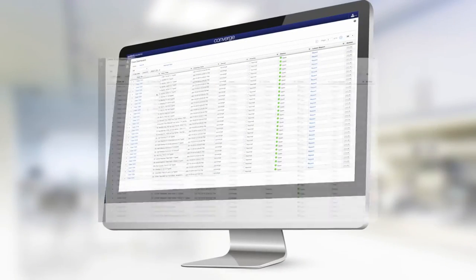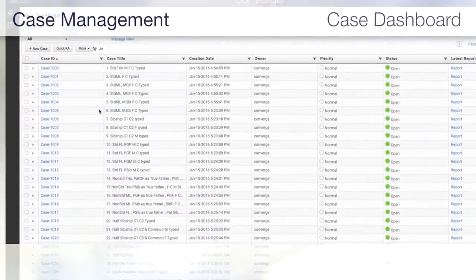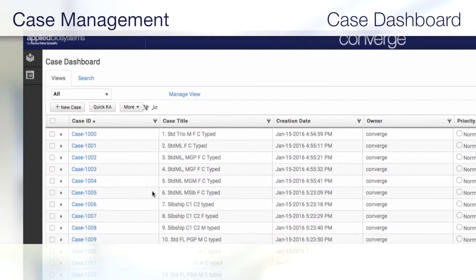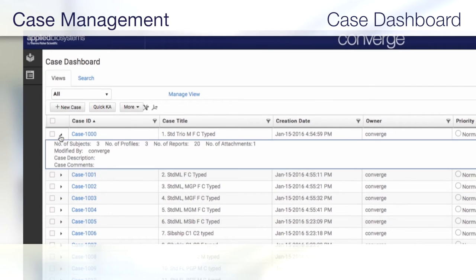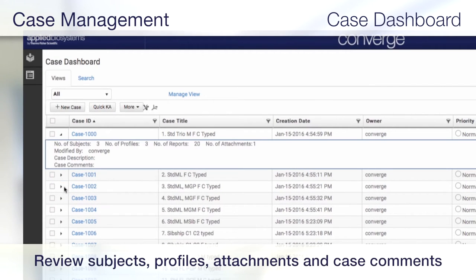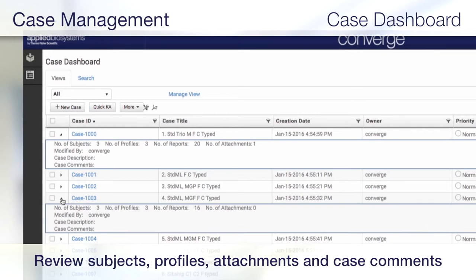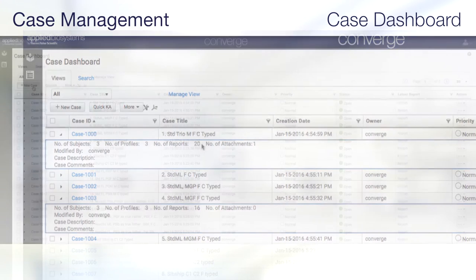With the Case Dashboard, you can review case status and access case reports with ease. See the number of subjects, profiles, and attachments, as well as case comments and descriptions for an at-a-glance overview of any case.